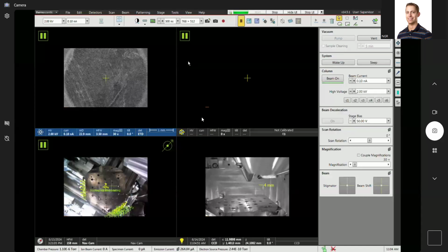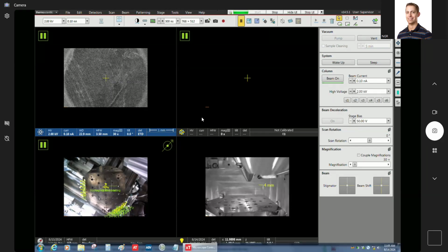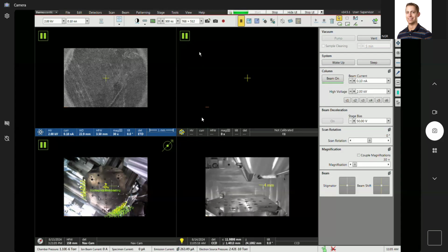So I got a little bit of a different video here, kind of a maintenance video. This is something I wanted to document because it comes up occasionally with use of your microscope. We recently had a planned process chilled water outage, so the microscopes had to go down for a few days. I'm on the PFIB here, bringing it back up right now, and I've got beams and everything on.